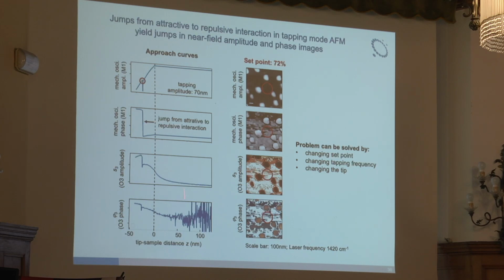So that's due to interaction, and it's really quite unexplored what is going on here. Is it an artifact or is it a real effect? Do we get more near-field signal because the tip comes closer to the sample? Could be. Then we could exploit that. That could be a positive effect because we suddenly get much more signal. That could increase the signal to noise. Or it's just a modulation of background. I don't know, to be explored.